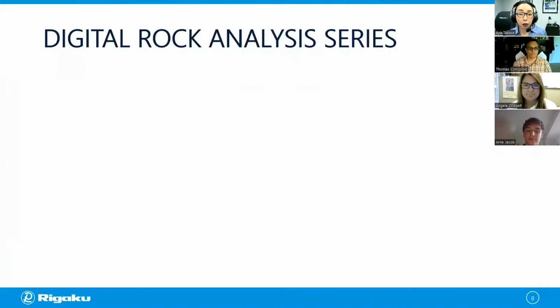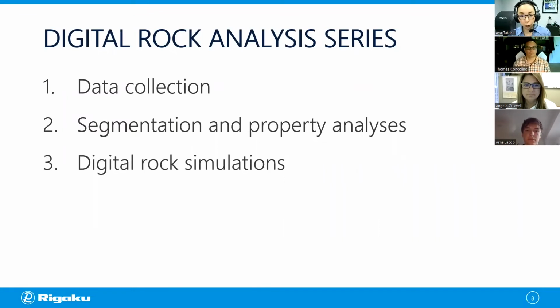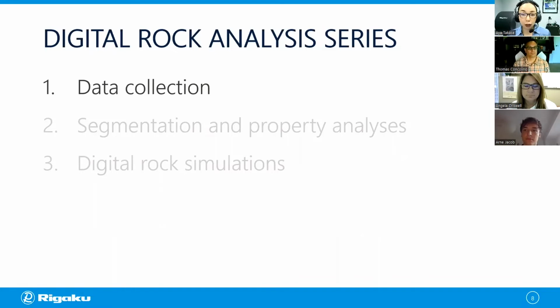So this is a 3-part series, as Tom mentioned. In the first part, we're going to talk about the data collection. And in the second part next month, we will cover segmentation and some of the property analysis. And in the third and the last session of the series, we will look into digital rock simulations. But for today, we're going to focus on data collection.